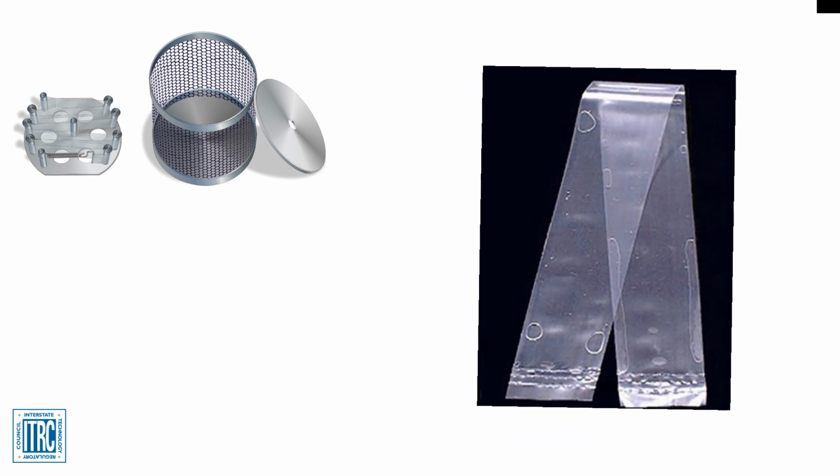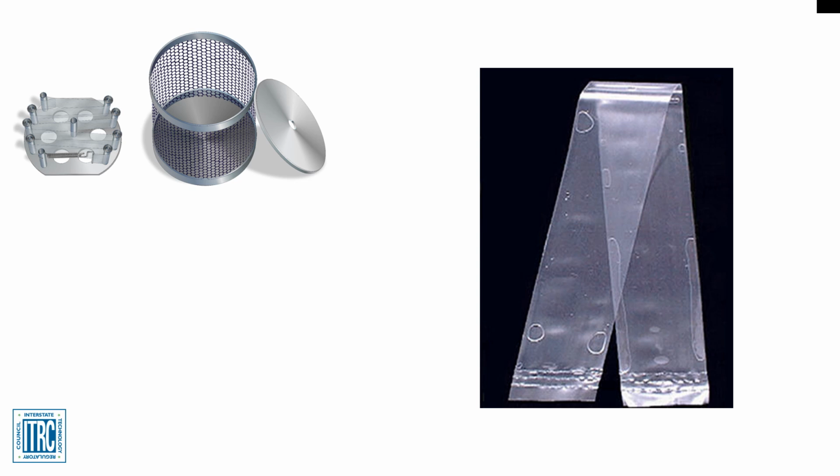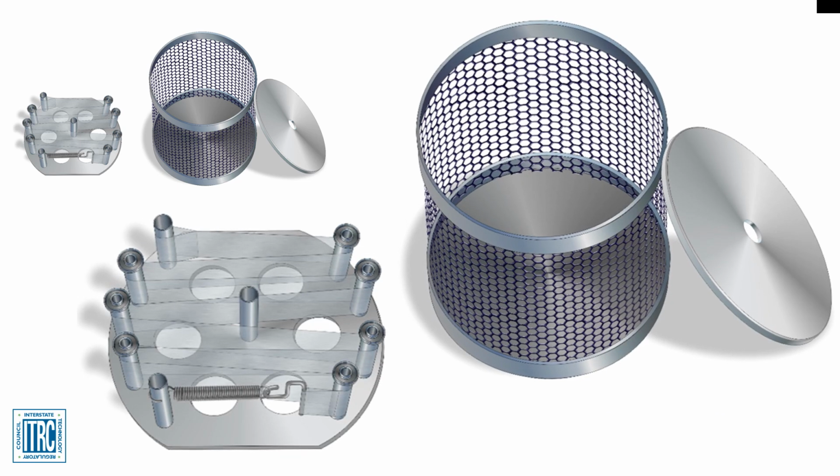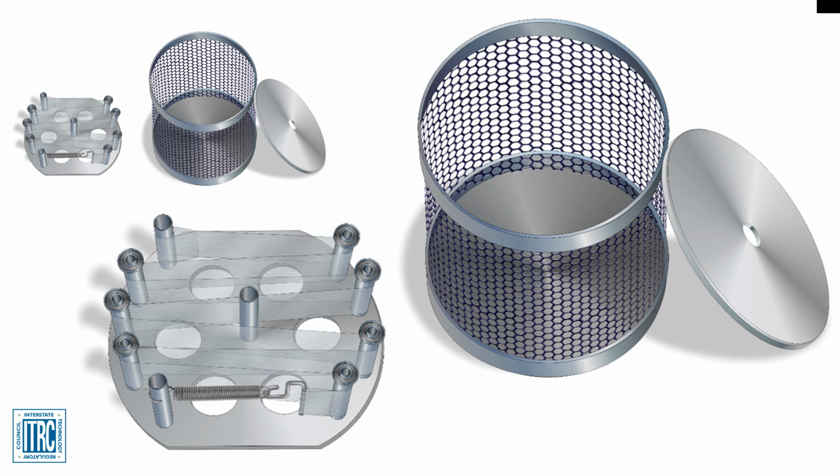The main features of the SPMD are the low-density polyethylene, or LDPE, membrane, which contains a thin film of the triglyceride triolein, which accumulates target chemicals, the carrier assembly that houses the LDPE membrane, and a protective canister, normally constructed out of stainless steel.